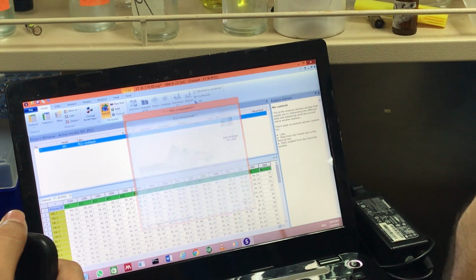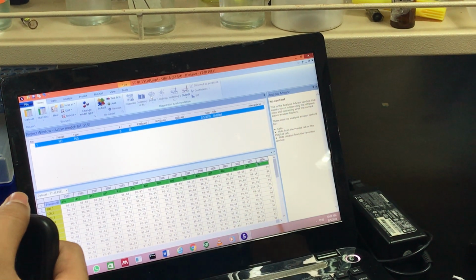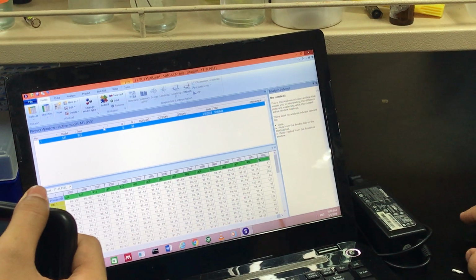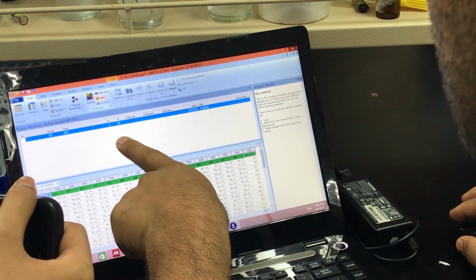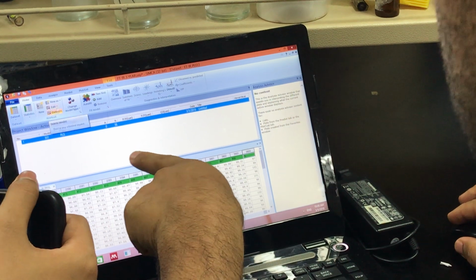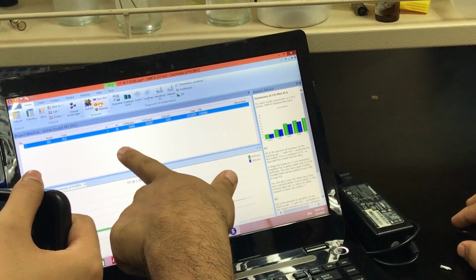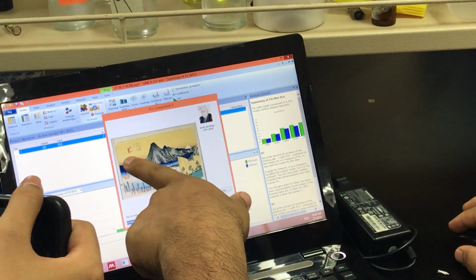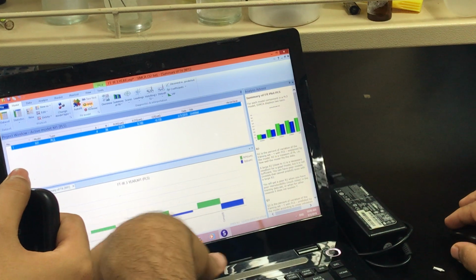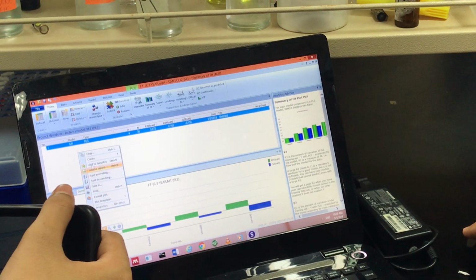Okay, auto fit. I mean, I cannot use the score plot. There is no difference. You can see here 0. I can just ask the software to add components, add difference. I can add as many as I want, 3 or 4 components. These are the components. This is the difference.